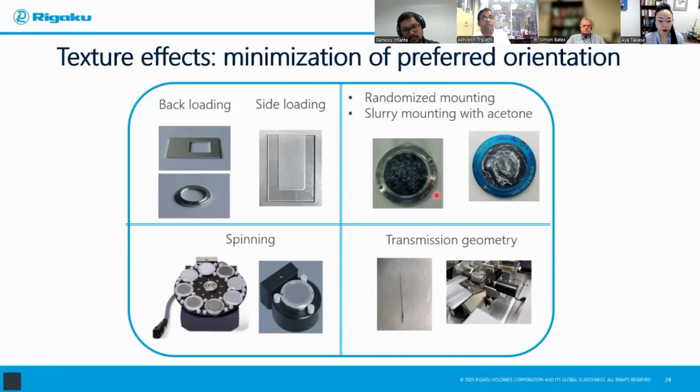You can also take a brush, drop a powder onto the slurry or onto a grease which doesn't have its own X-ray signature. This will let the small crystals drop on it with every possible orientation. Remember, our goal is to see the edges, not only just the flat sides or only the fiber. So that makes it more random.